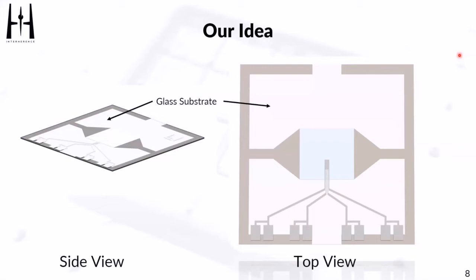And this glass substrate has an optically transparent heating element in the center, and the temperature sensor, which allows to make use of a feedback system between these temperature sensors and the transparent heating element, such that the temperature can be adjusted in your field of view. This is actually the bluish area where you want to measure, which can be adjusted very precisely.